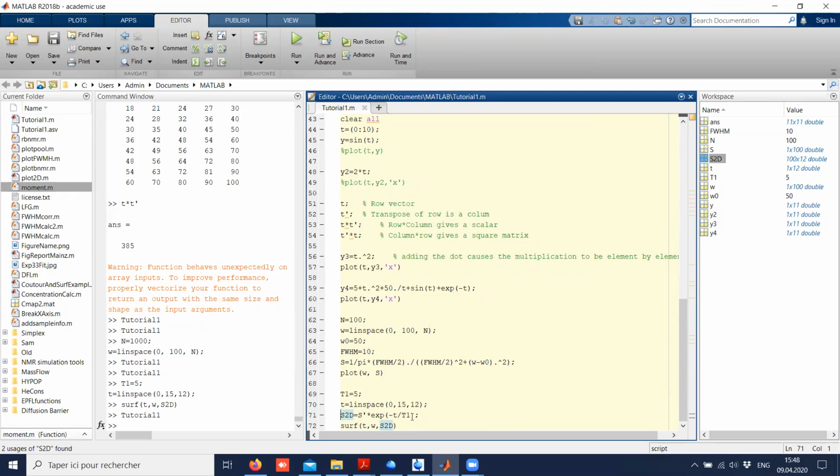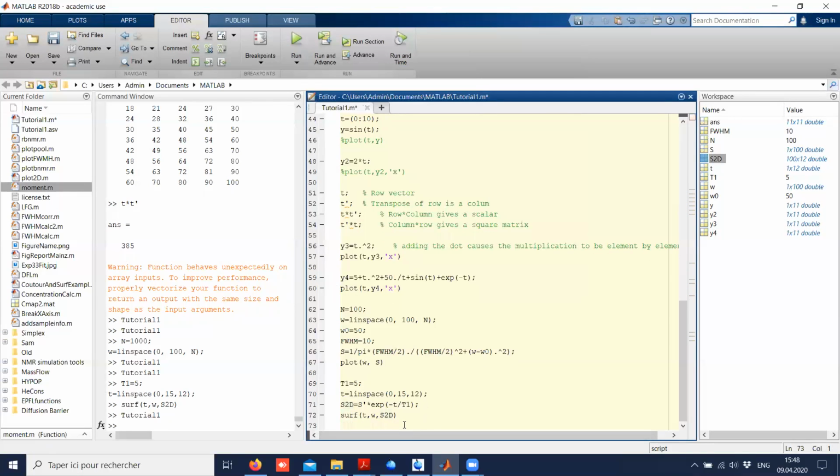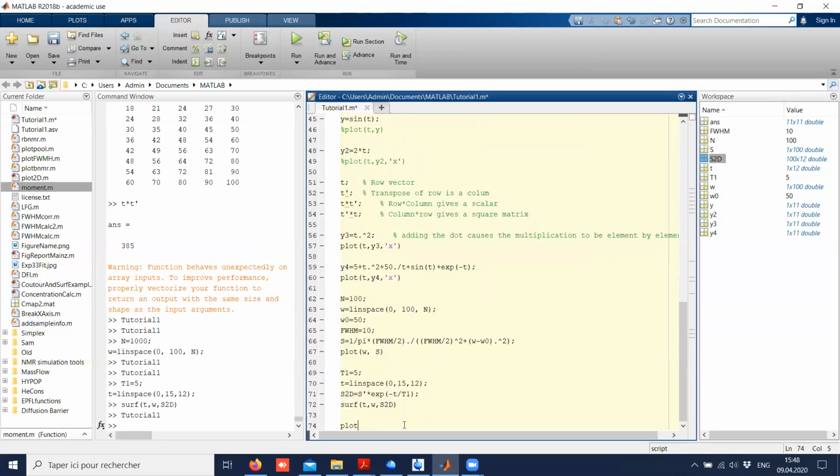We're on this sort of topic. In Topspin, for example, you can create very nice stacked plots where the spectra are not only shifted vertically but also horizontally. Is there a way to nicely create such a thing in Matlab? If that's too complicated for now, we can look at it after.